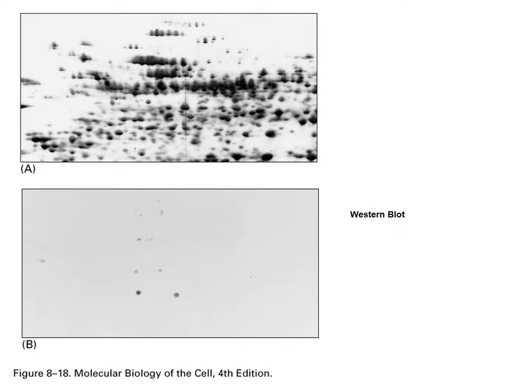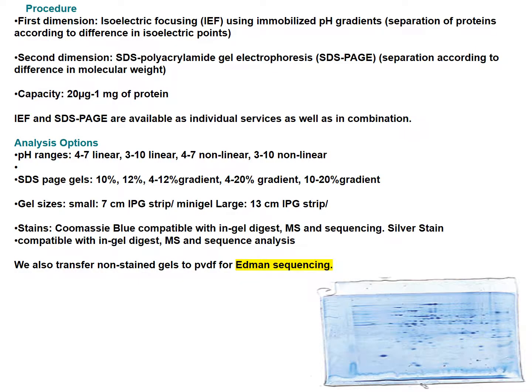Okay. And we're going to talk a little bit about Western blotting, how we actually apply all these proteins to a piece of nitrocellulose or PVDF membrane, and then apply an antibody and visualize proteins that are specific to certain antibodies. So it helps you identify what those proteins are if an antibody recognizes them here.